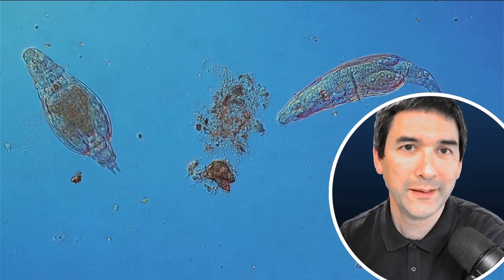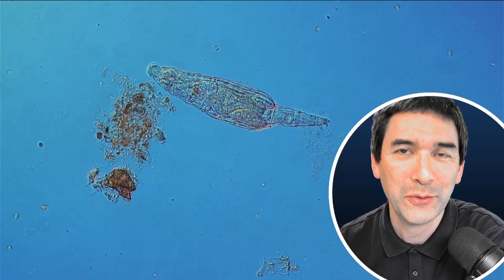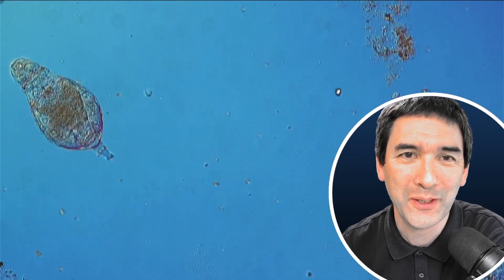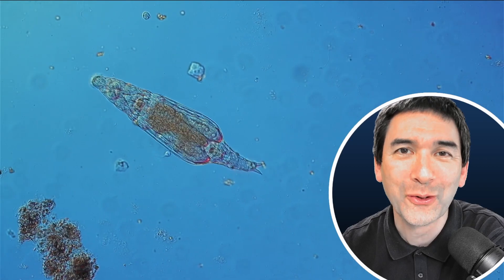We're going to put it under the microscope and maybe we'll be a little bit lucky. And look at this — what I found right away! It didn't take me long to find two beautiful specimens of rotifers. Here's one, and here's the other one, slowly and graciously moving along the microscope slide. Let's just follow one of them.